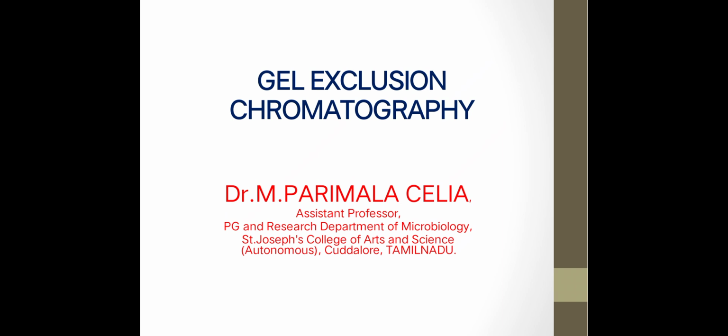I am going to present a topic: gel exclusion chromatography. It is otherwise called gel permeation chromatography.